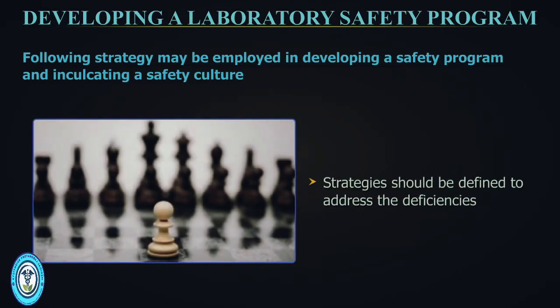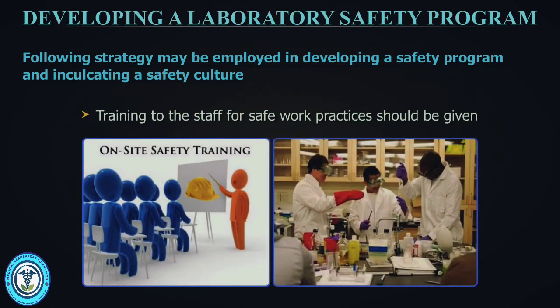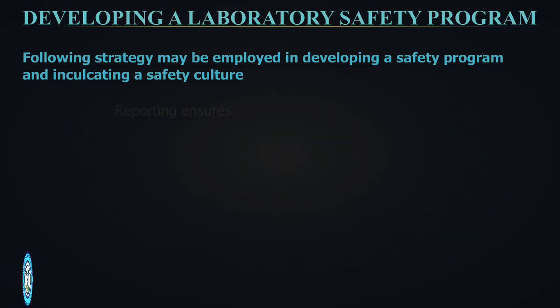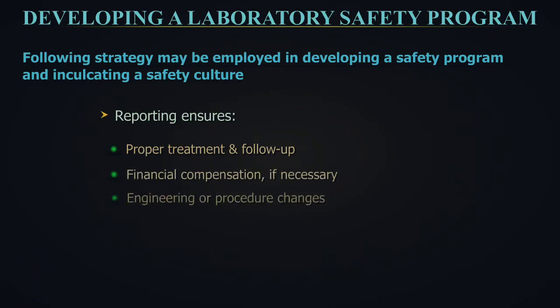Strategies should be defined to address the deficiencies. Training to the staff for safe work practices should be given. Reporting of hazards, non-conforming events, and incidents should be encouraged. Reporting ensures proper treatment and follow-up, financial compensation if necessary, engineering or procedure changes.